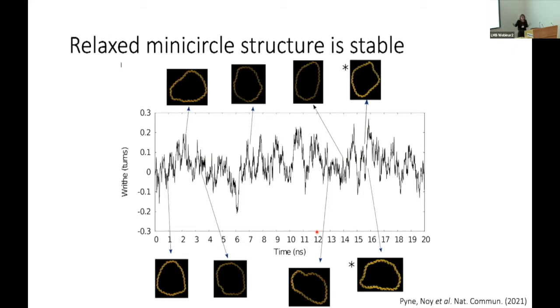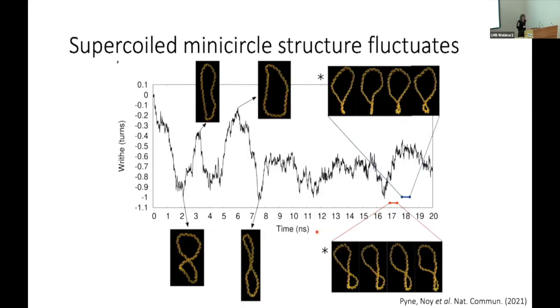So we're in a single molecule symposium. We're talking about dynamics being important. If you have linear or relaxed DNA, it doesn't do anything. So writhe is a measure of number of turns, and this DNA is sitting very statically. But as soon as we add or take out a twist, and usually take out, so as soon as we add negative supercoiling, these structures become incredibly dynamic. They no longer sit still. They oscillate through a huge range of conformational shapes, and they move around very, very quickly.